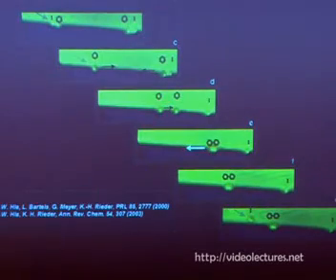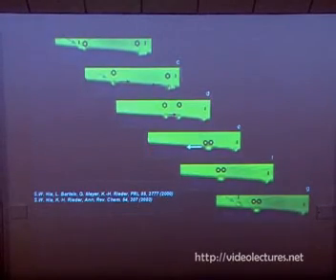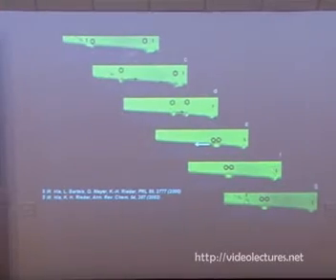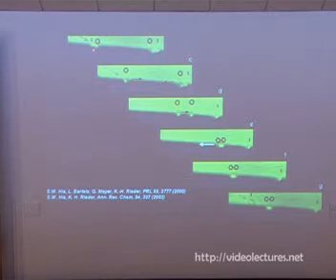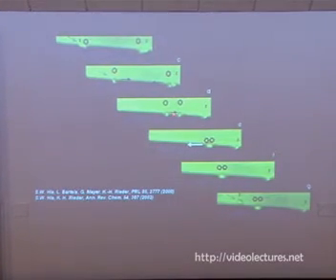So I'm going to show you how we generate this. Actually, I'm having a little trouble with these slides because some of them are up there, not here. Anyway, we started with the iodobenzene molecule up here. And then we injected electrons to break the iodine. And afterward, we pick up the iodine atom with the tip. It's gone. This one is remaining. And then we move the remaining benzene rings close to each other.